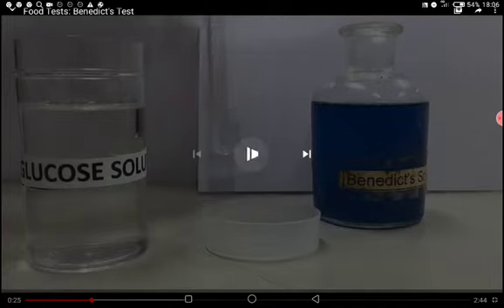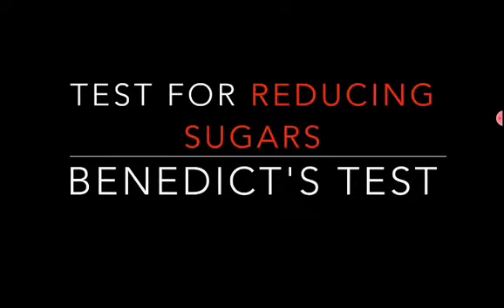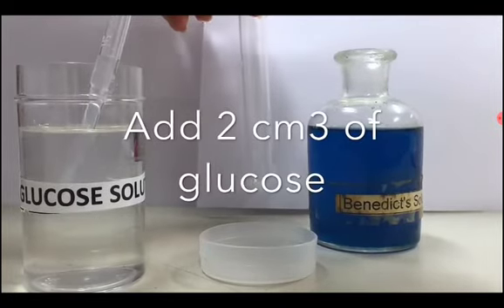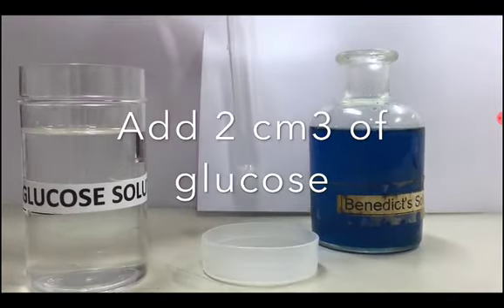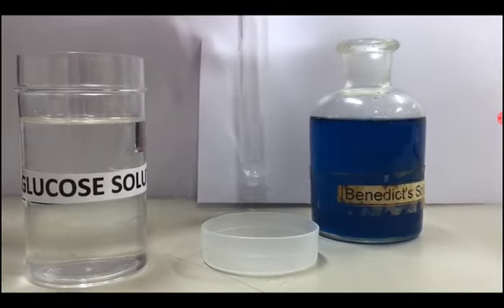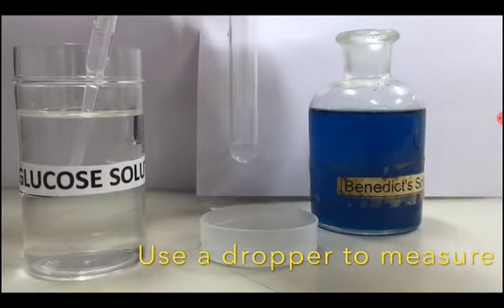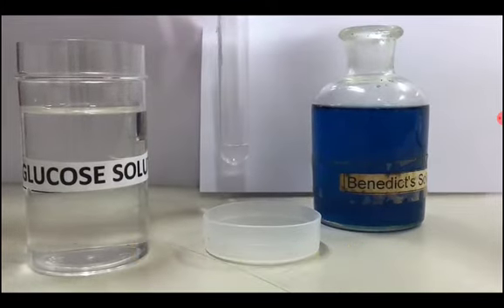So let's start afresh the video. Add about 2 cm³ of glucose solution. We can use a dropper to measure exactly 2 cm³ into the test tube first.